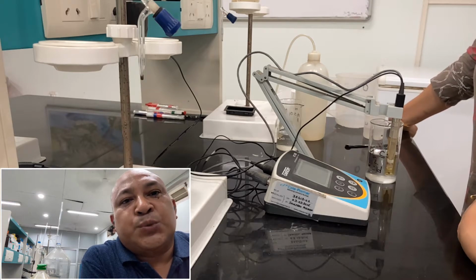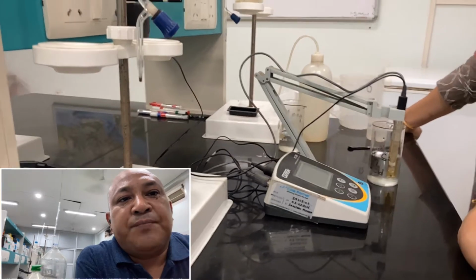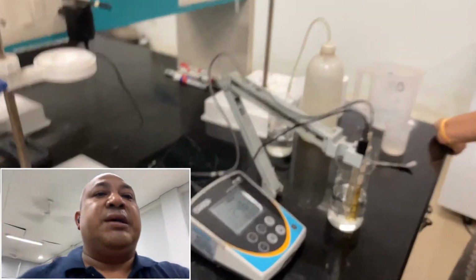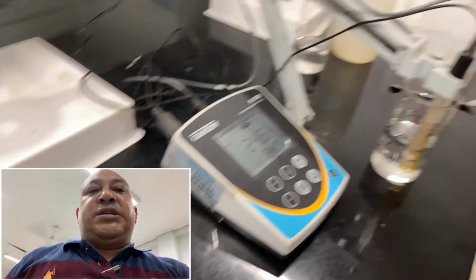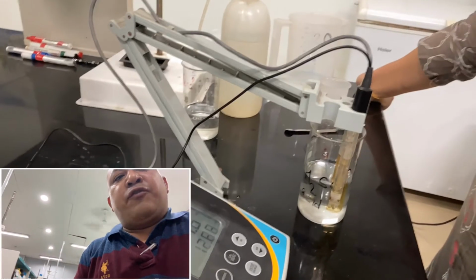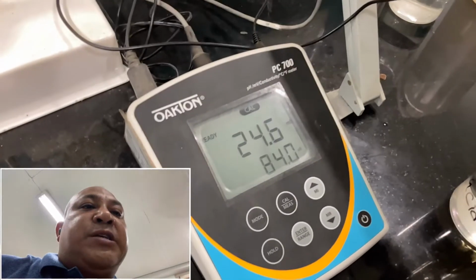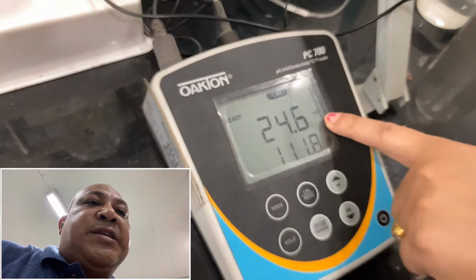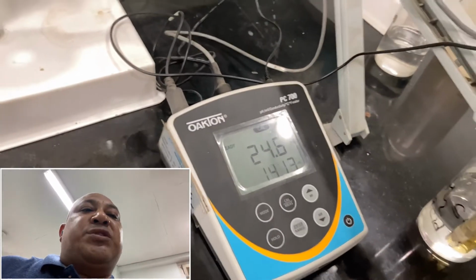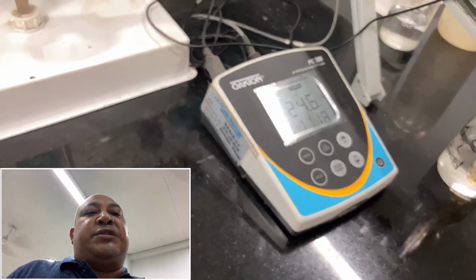So to estimate this, we have the conductivity meter and we are going to measure it. The conductivity meter here, this is the one, and we first calibrated it. We kept the sample over here and the measurement, you can see over here, is 24.6. What is the unit, please? It is microsiemens. That means the conductivity of the water is 24.6 microsiemens.